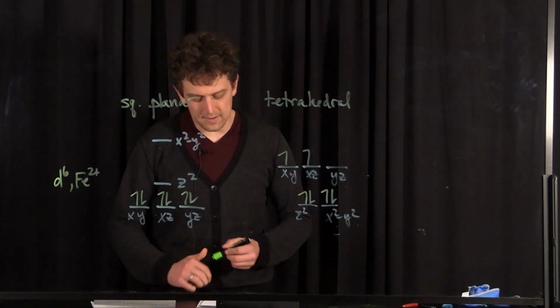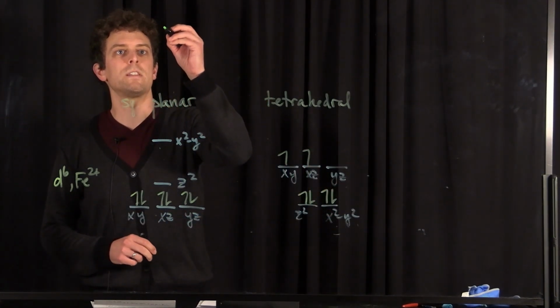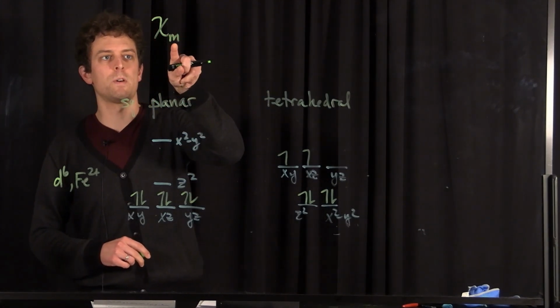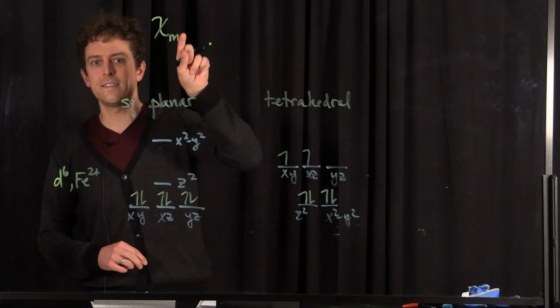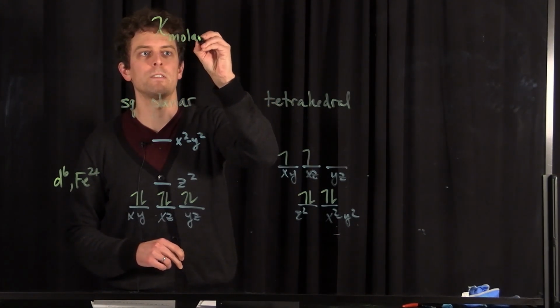So here is the commonly published equation that you might see for magnetic molar susceptibility. Chi m is our term, and you might see a small m here. Sometimes it's mass, sometimes it's molar, so you need to double check. I'm going to be specific so we don't get confused.